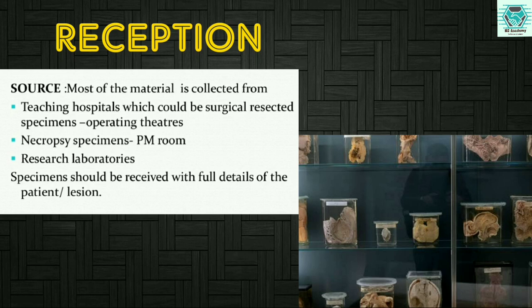An ideal specimen is received fresh and, of course, in the unfixed state. However, it is mostly obtained from the pathological laboratory. After being examined, it will already be formalin fixed. If planning to use a specimen for the museum, part of it can be kept without disturbing it for the museum.